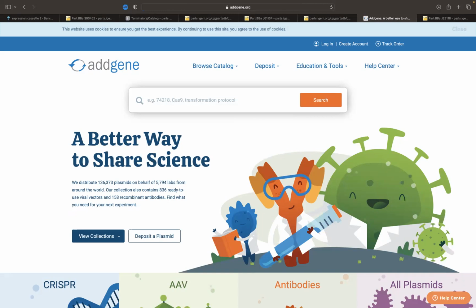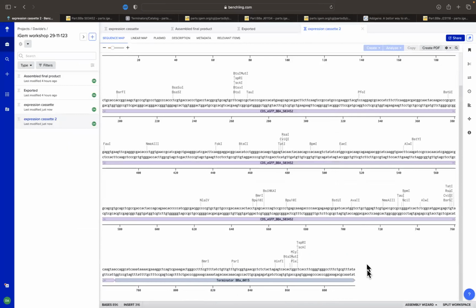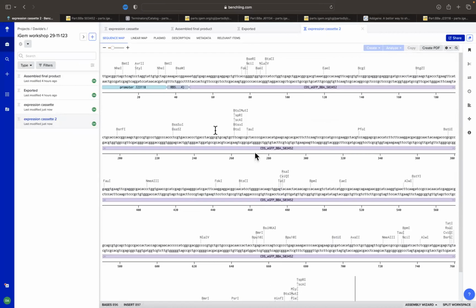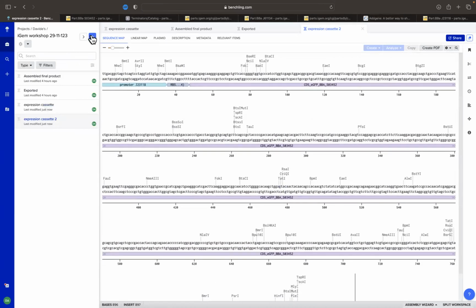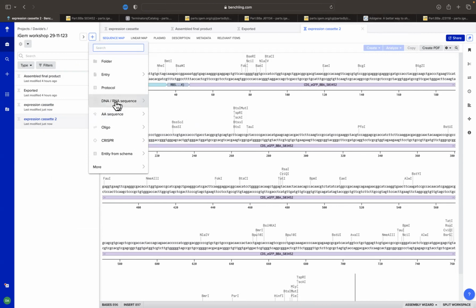As for the question asked by Teresa, she asked whether we only need to paste each part directly into Benchling and the program assembles each part in order. Kind of. You go to the part, go to Benchling, for instance, and I think SnapGene is going to work the same way. You can directly upload a sequence. For instance, from Addgene, we can download it. I'll show you as soon as we have one.